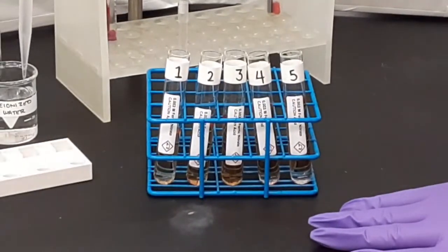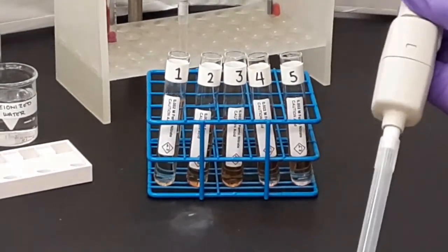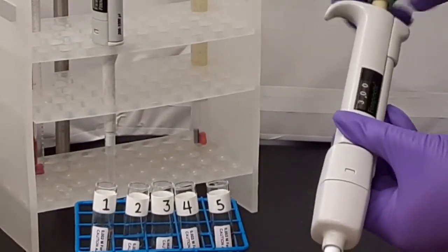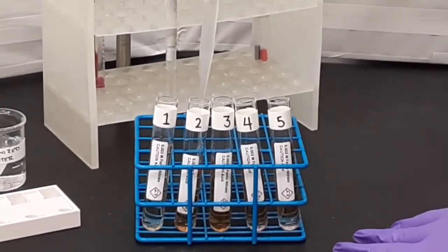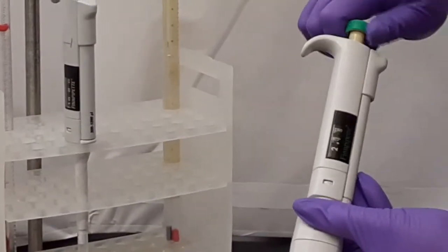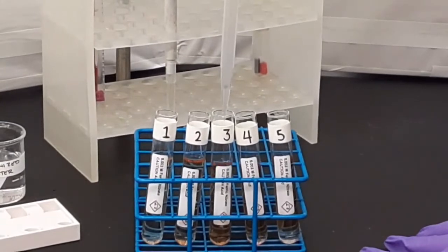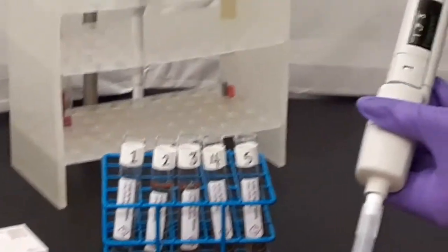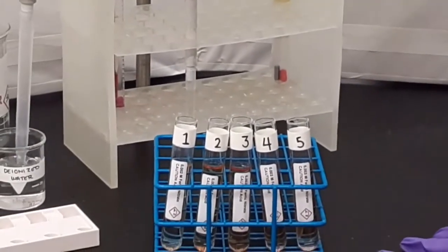Five milliliter pipette set to 4 milliliters. This tube now has 10 milliliters. Now she's set to 3 milliliters. And now the last aliquot.